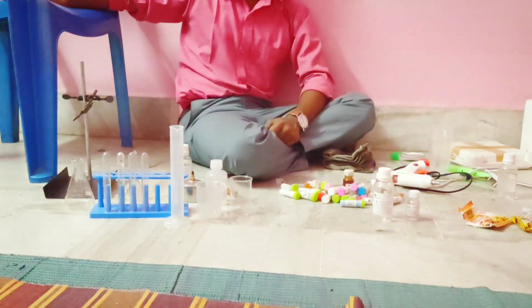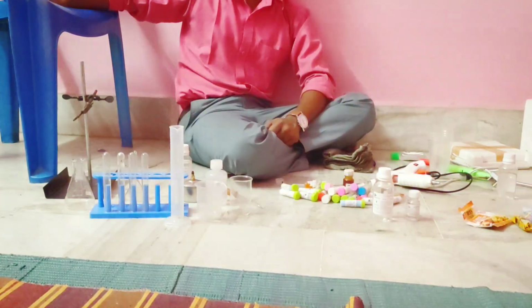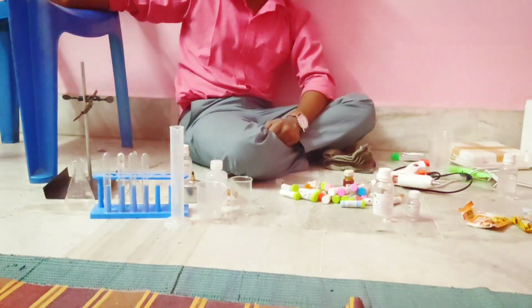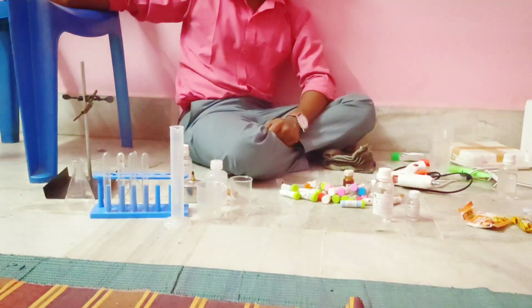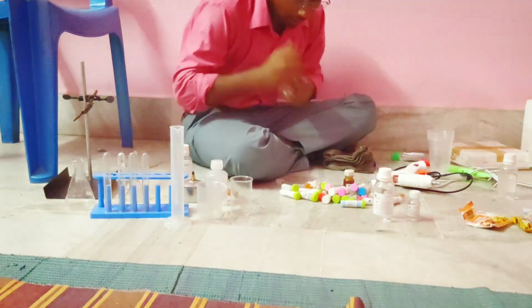No, definitely not. I have already done that experiment. You have to use starch. It is the starch which will make a coordinate compound with iodine. Yes, I was thinking to demonstrate that, but actually I don't have it. Sorry, I have starch.